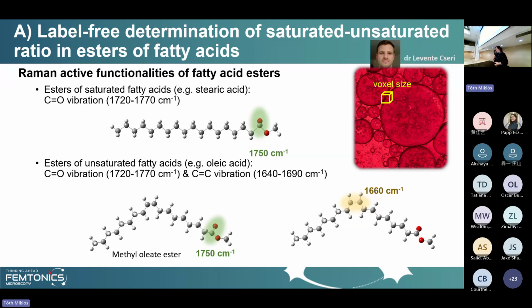Before moving to tumor imaging, I would like to show you a few examples of how our setups can perform. We have more departments at the company, and one of them had an in-house project where chemists wanted to measure a label-free determination of the saturated and unsaturated ratio in esters of fatty acids.